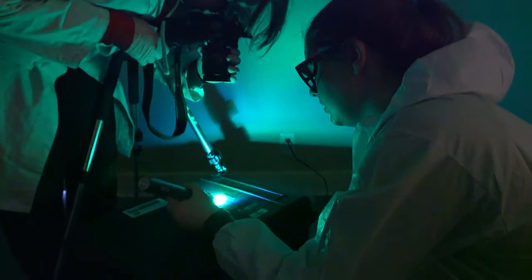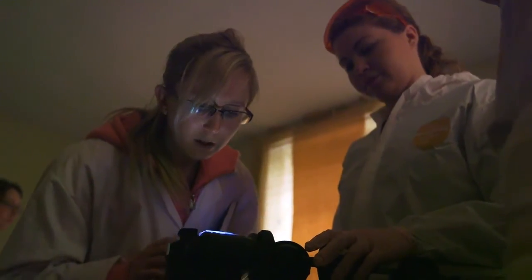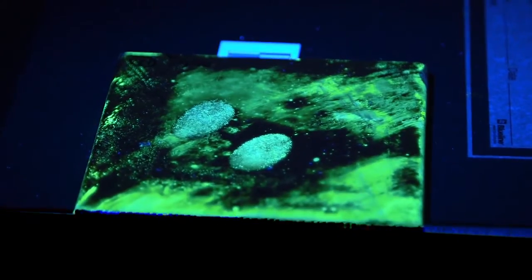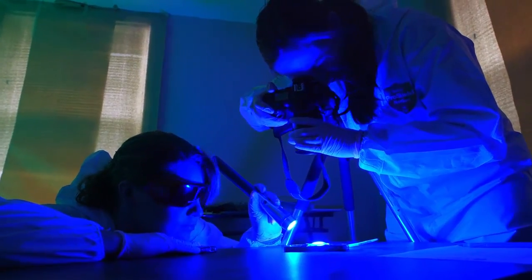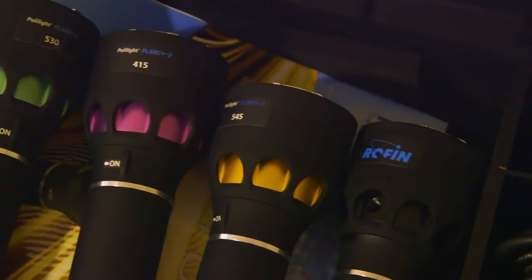Students learn to use alternative light sources to locate bodily fluid stains for further collection and analysis. An alternative light source can also be used to aid in the visualization of fingerprints that have been chemically enhanced with a fluorescent dye.